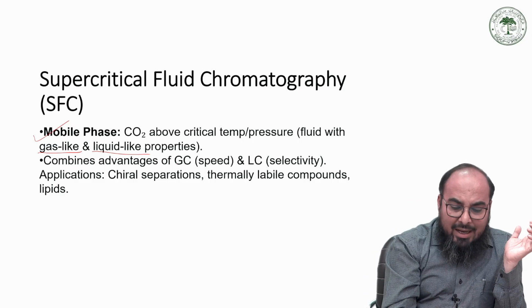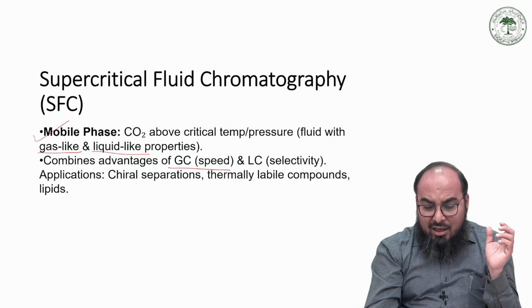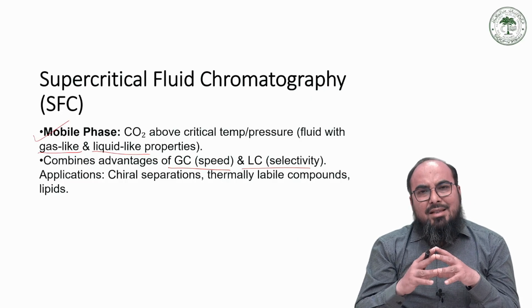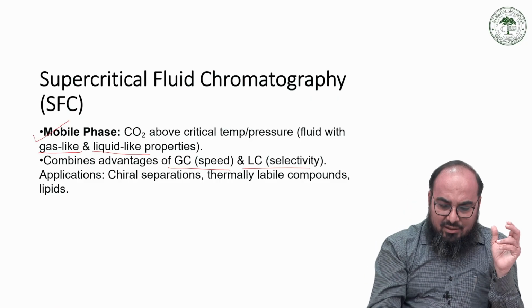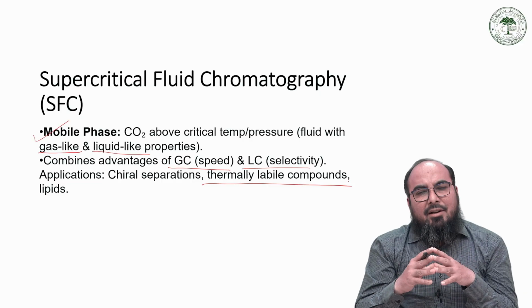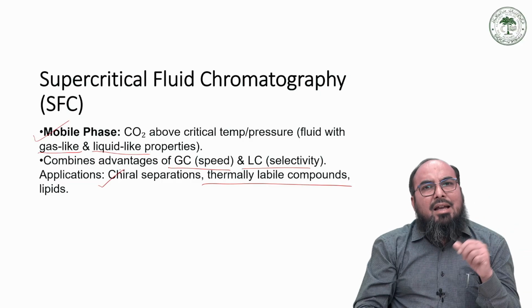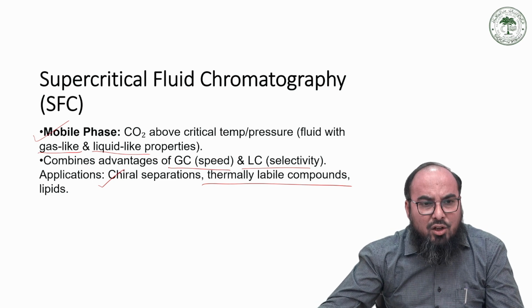So it combines the speed of gas chromatography with the selectivity of liquid chromatography. You can separate thermally labile compounds by using SFC, which you cannot separate by using simple GC. Similarly, you can separate chiral compounds using SFC, that is supercritical fluid chromatography.